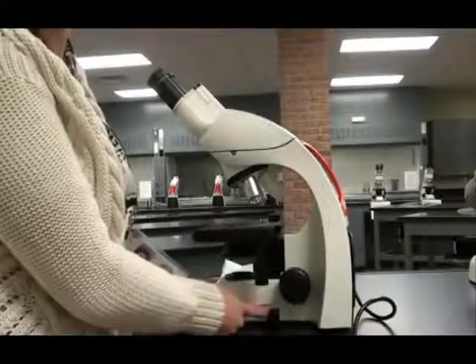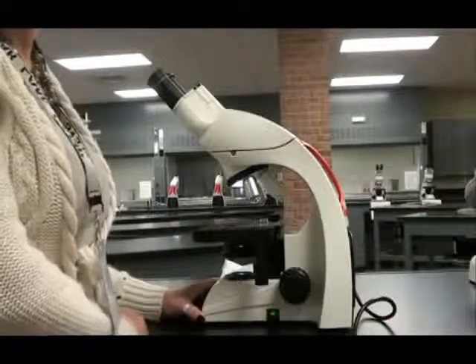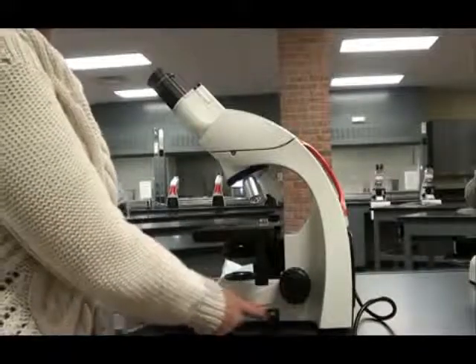Compound light microscopes typically have an on/off switch in the base. This switch lights up when it is turned on.